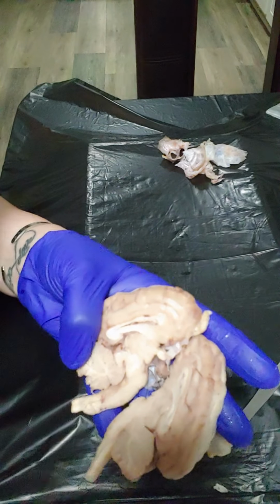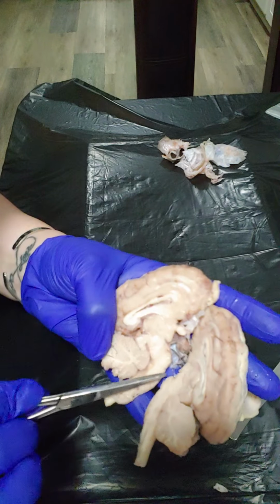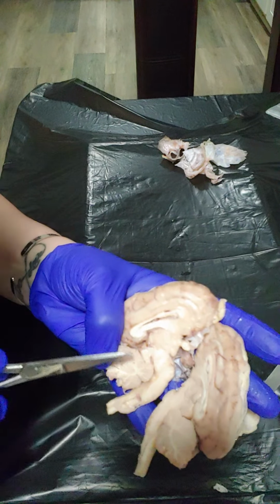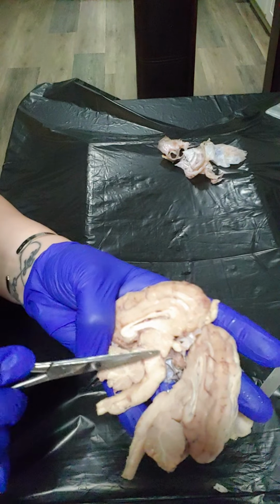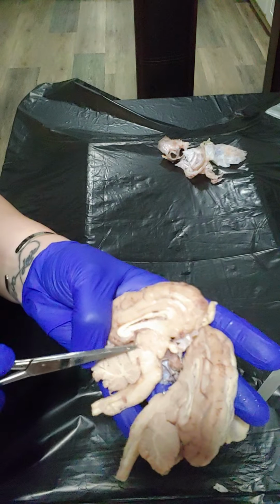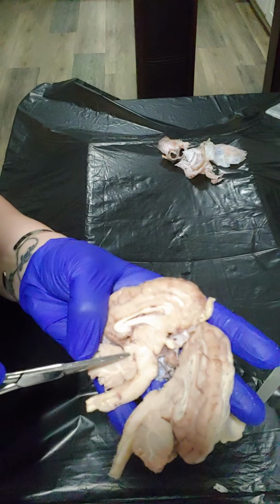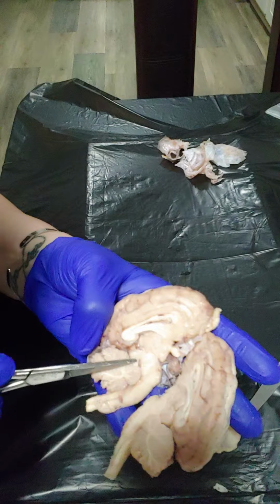Okay. Then this section in here is going to be the diencephalon, which is going to consist of your thalamus, your hypothalamus, your epithalamus, and your pineal gland, which I'm pretty sure mine's broken because I never get enough sleep. So I don't have enough melatonin.